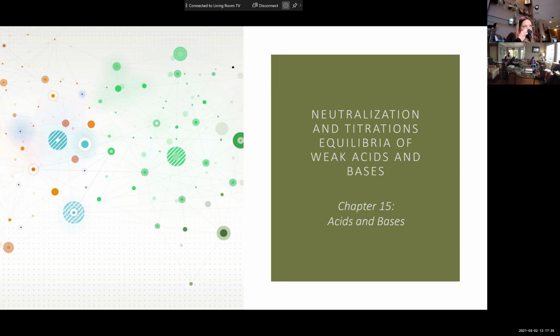All right, so we're going to talk today about titrations, which is what we did today. We did a back titration. And equilibria. This was a titration where you had to count the drops, which is really kind of a pain. But you're counting the drops for the sake of trying to come up with the volume. When you use a burette, that's the way to avoid that, because you can get the exact volume from the burette, still going drop by drop. So when you do a titration in a couple weeks, you'll be using the burette, which is kind of the standard.